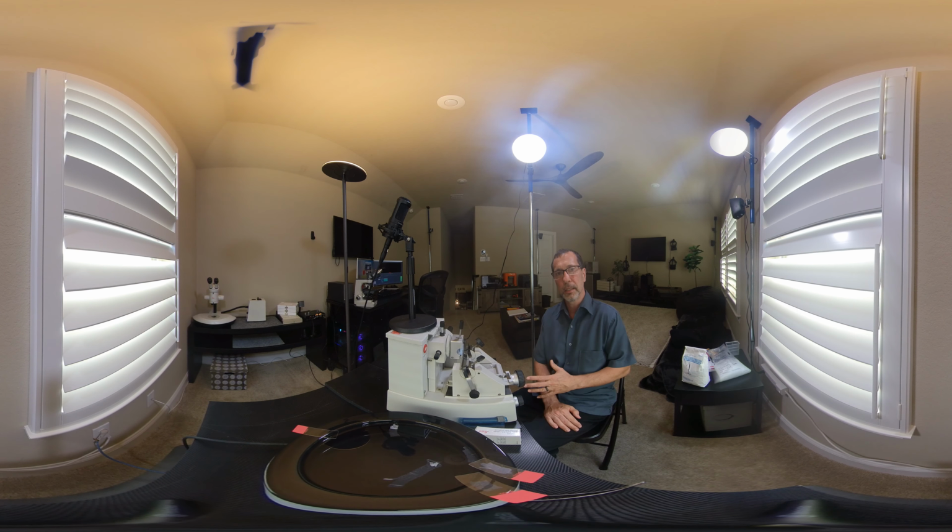But at the beginning, it's hot melted paraffin, and at the end, it's solidified. I think now's a good time to talk a little bit about the overall goal of embedding, and that is to take the tissue and orient it and place it in the correct plane, and when that's done, freeze it in that spot permanently so that it doesn't roll, turn, or move during the cutting process.